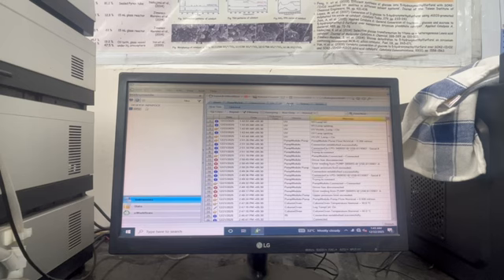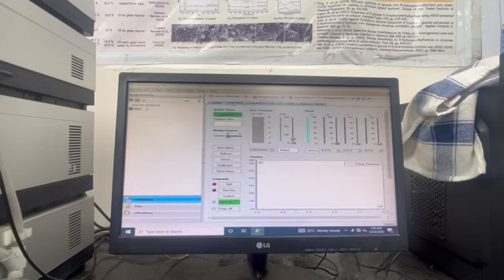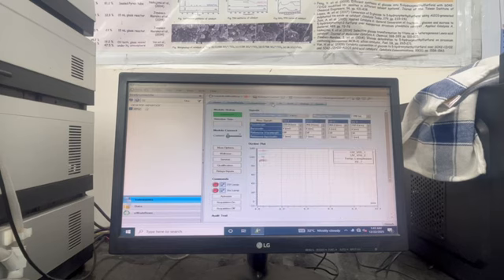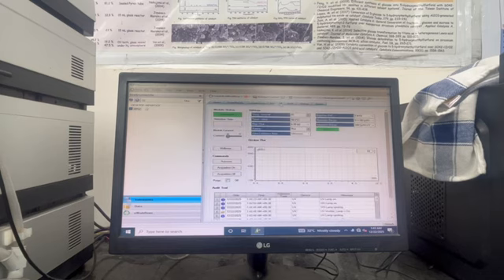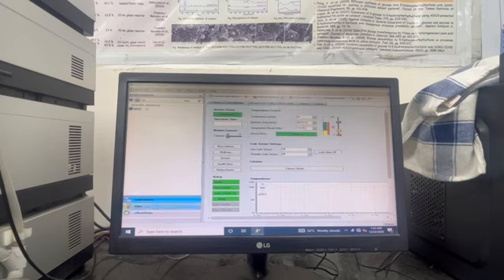Always the audit will tell us what is going on with the machine. So like you see, UV lamp is now on. If we go back, we can see it's on. So now it means everything is ready, the pump is going, temperature is already ready, UV is also on, RI is ready. So it means we can do our analysis. So we go to the data.